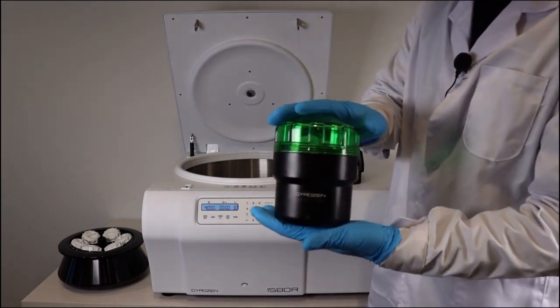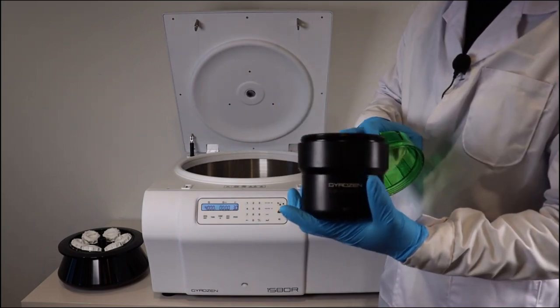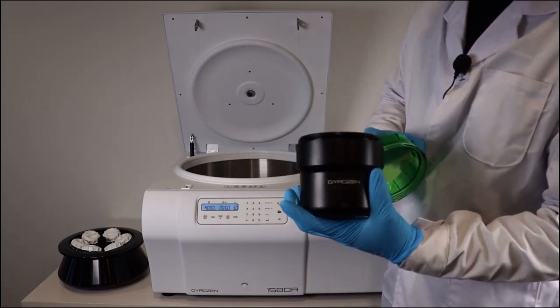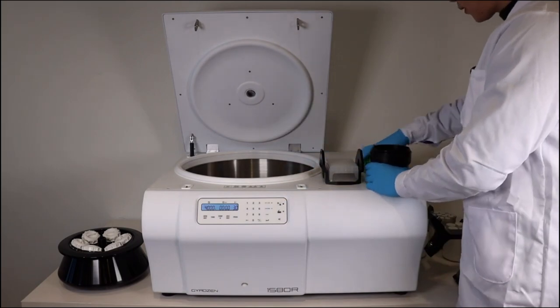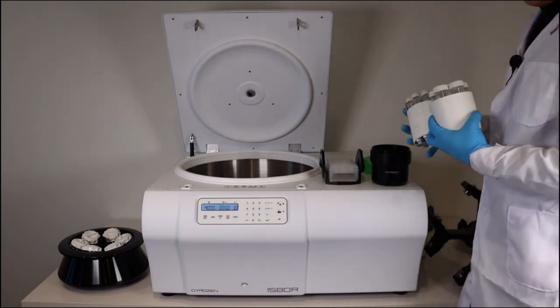Also, there is this rotor with different adapters of 8 places of PCR strips. There is a swing-out rotor for micro-titer plates or deep well plates. You can adapt to many capacity programs.